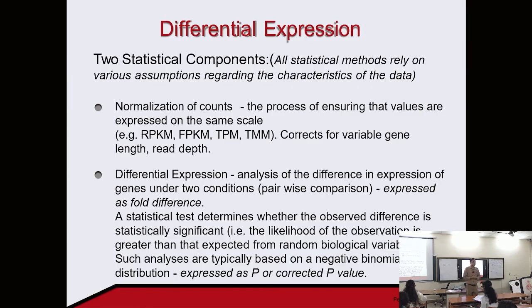This is called fold change. So fold change is equal to 10, and then you would want to assess the statistical significance of this. Is it really significant, or is it just by random chance, just due to some biological variability? That is the statistical significance test that you would want to perform to assess whether the value of fold change is significant or not.